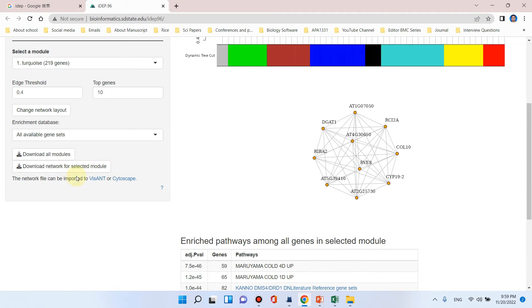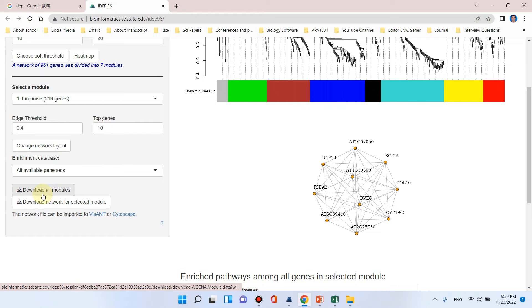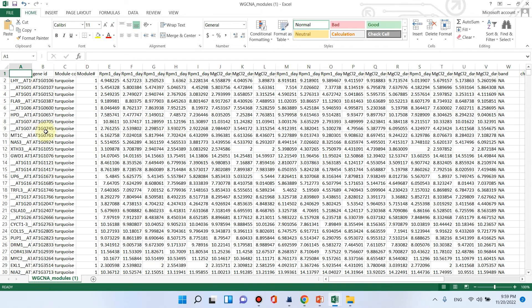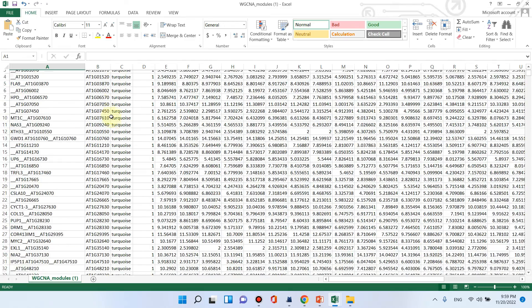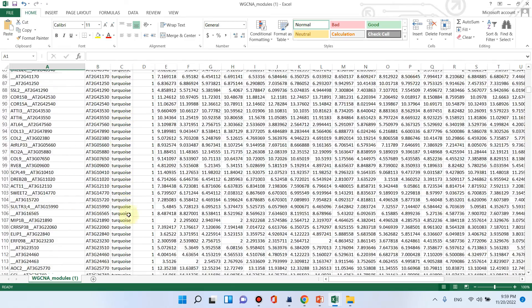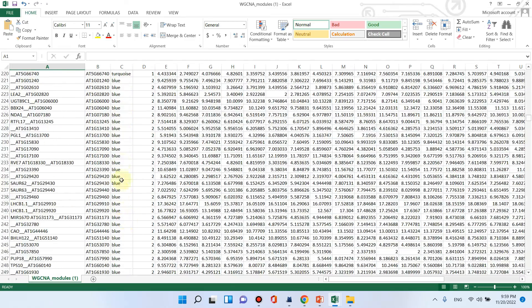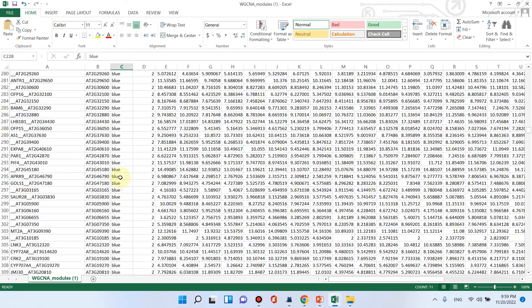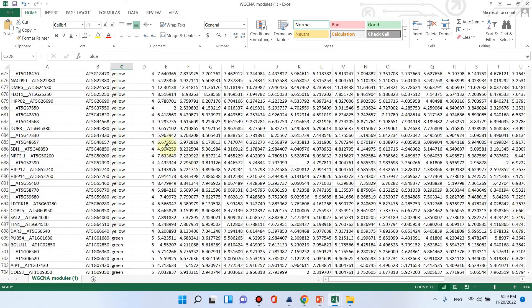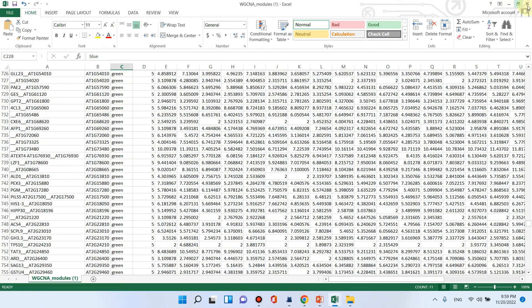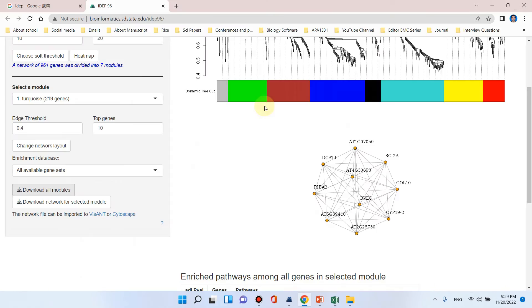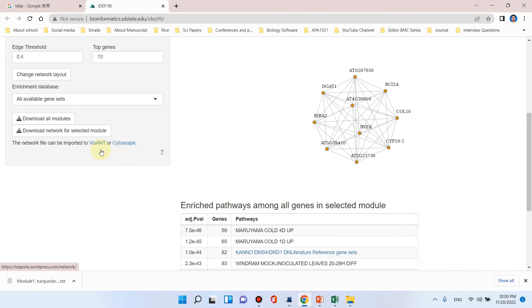Similarly we can download the list of all modules by clicking on this. You can see here a list of all modules have been downloaded. Here is the gene ID and here is the first module that is turquoise. Here are all modules, those genes which belong to blue, and similarly all seven modules have been downloaded.